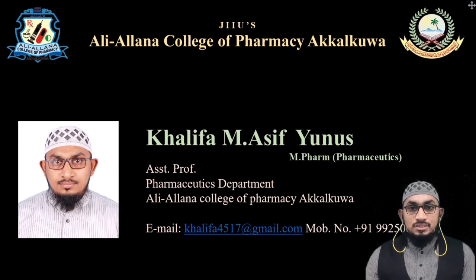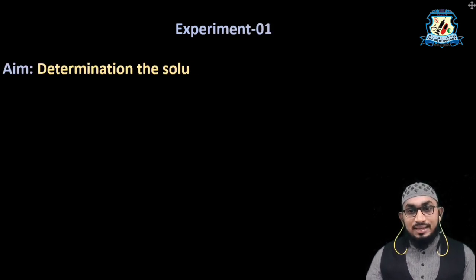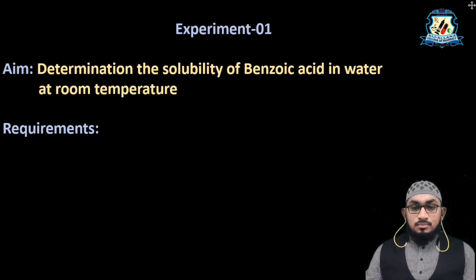Today I am going to discuss the solubility of any solid in liquid. So the aim of today's experiment is determination of solubility of benzoic acid in water at room temperature. So let's see the requirements of today's experiment.